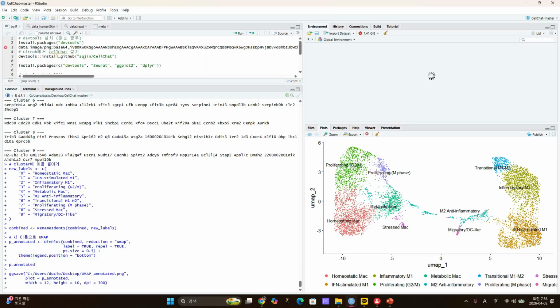Okay, so I want you to follow, after finding the data set, that same data set in the paper, or you can ask directly what's going on there, and then you already have your plan. Maybe why you are choosing that data set, based on your ongoing study and your data set, you can try to link. And next, if you analyze this data set, you can put it in your paper supplement list. What is the meaning of our study? Why are you starting your study?